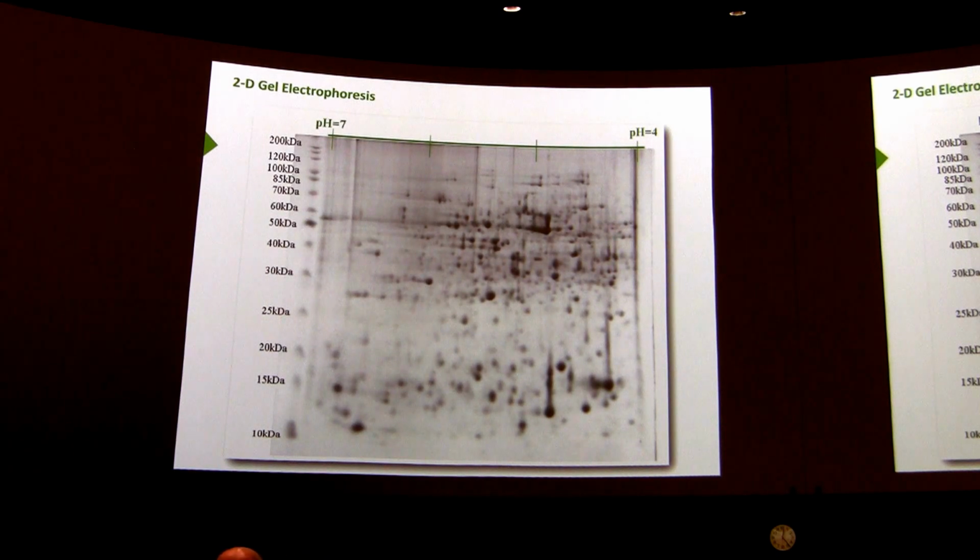So you know this protein that shows up on the lower right and it's very dark and abundant. You look at that and you say, yep, I know what that one is. That's ribosomal protein L21. Right? And I could run a similar gel for a different tissue and say, wow, I don't have quite as much L21 in this cell. Right? So the reproducibility of this is important, and that separation and analysis is also important.